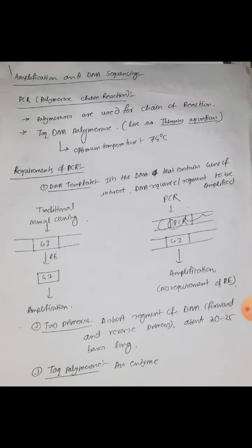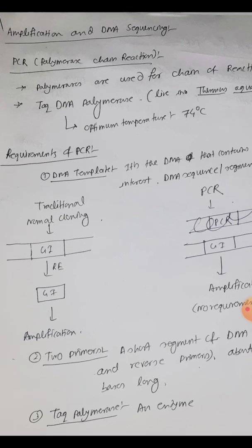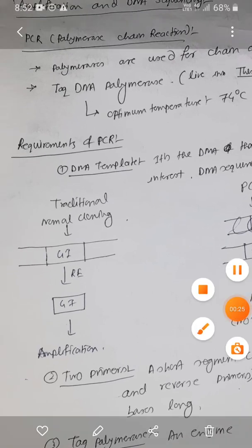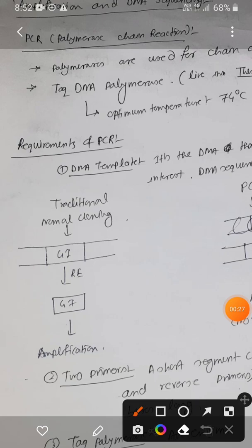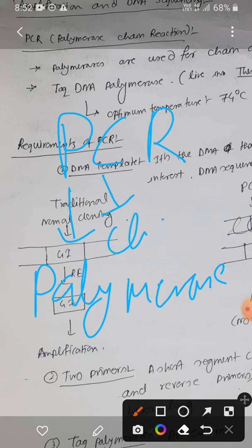So in this video tutorial, we are going to see the polymerase chain reaction technique. Although I have already made a couple of videos regarding PCR, today in simpler words we are going to revise the entire PCR technique. So what is PCR? The full form of PCR is polymerase chain reaction.